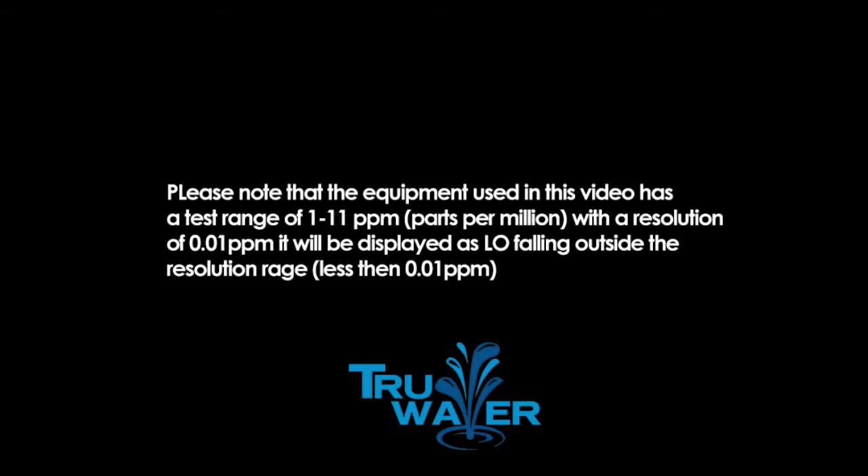Please note that the equipment used in this video has a test range of 1 to 11 parts per million, with a resolution of 0.01 parts per million. It will be displayed as low, falling outside the resolution range, which is less than 0.01.